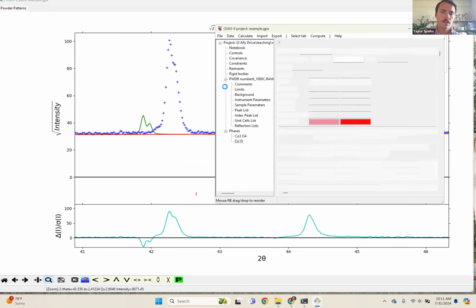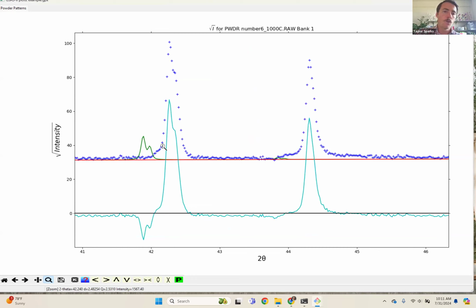And if we look at this, I've overshot it a little bit, but check it out. It's starting to overlap a little bit. Because that's overlapping, if it moves it the wrong direction, the score would go down, and if it moves it the right direction, the score would go up. So it should be able to learn it. Same thing over here. So I bet that we could turn on our refinement right now, and it would actually be able to find it.